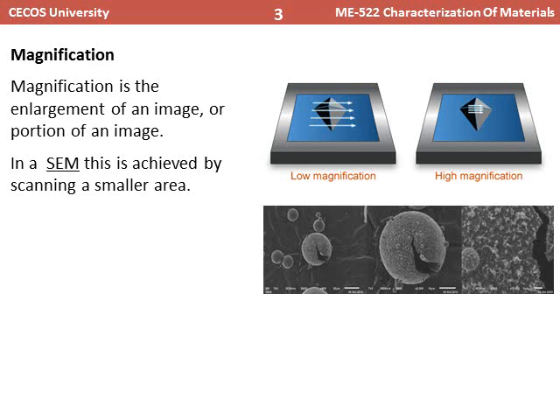For example, at the top right-hand side, there are two images taken at low magnification and high magnification, with the line scan, where the beam of electrons passes from top to bottom. You can see the area scanned is very large in the case of low magnification, whereas in higher magnification a very small area is scanned thoroughly.